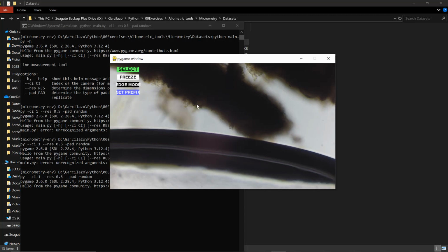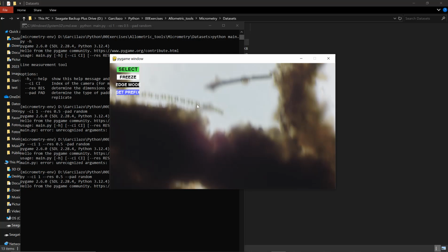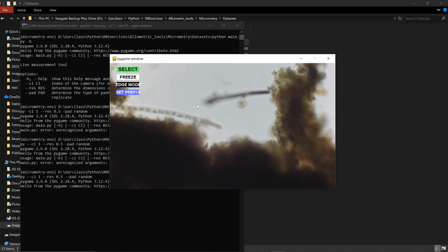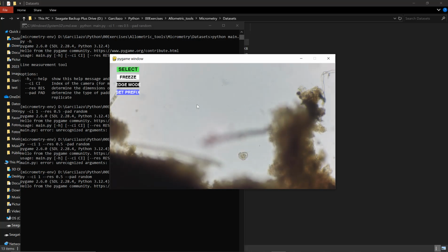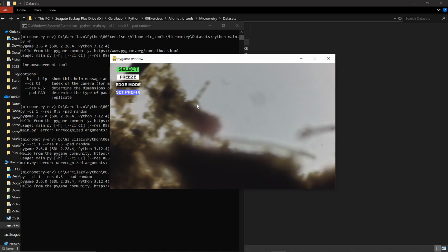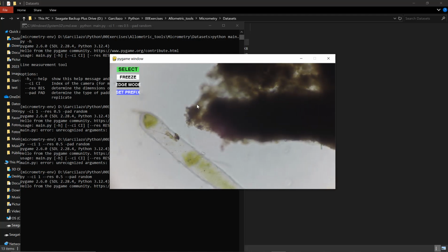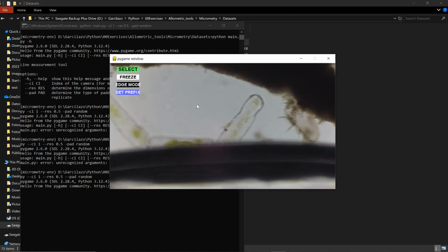I'm sorry about that. So let's press enter once more and hopefully it will open. There we are. Okay, so notice that now the place is getting crowded. The buttons are starting to get a little squished, so I don't necessarily recommend doing this, but sometimes it's necessary because of performance reasons. Sometimes, less pixels to render makes the computer faster, depending on what operating system you have. But hopefully you'll get your hands on something that is a little more powerful.